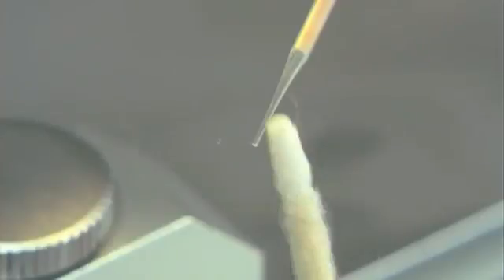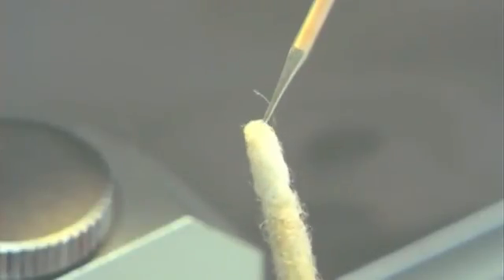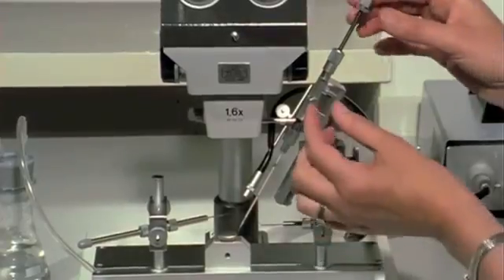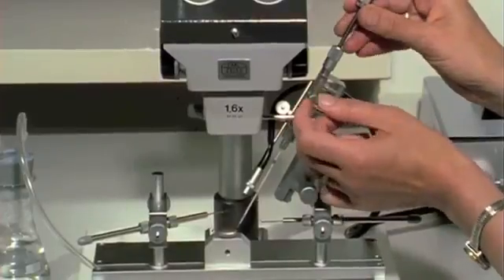If necessary, the tip of the cannula is cleaned off with a sterile swab. A drop of diluent closes the capillary to prevent the semen from desiccation. Now the syringe is ready for insemination.